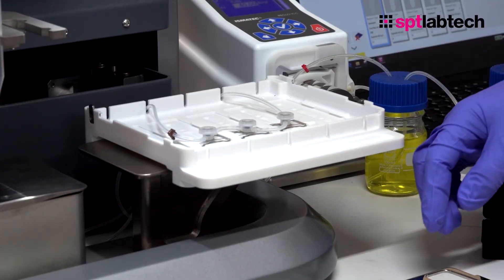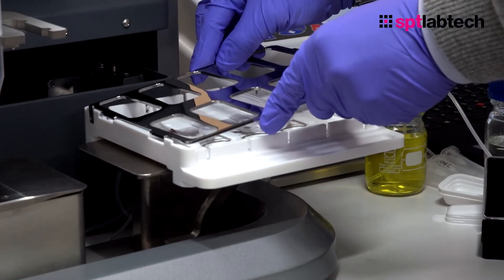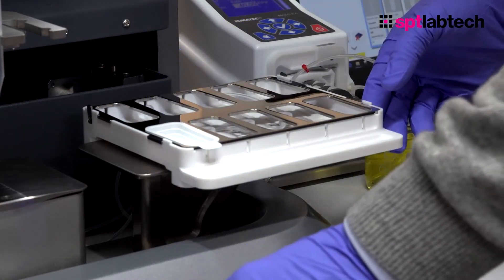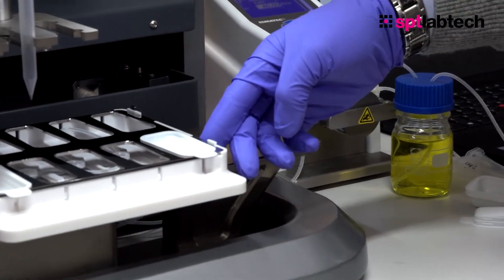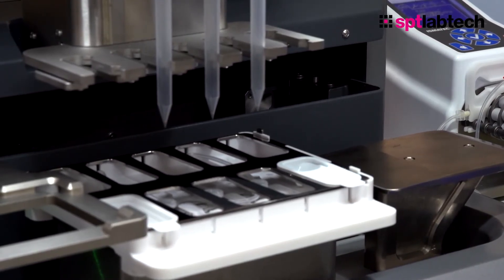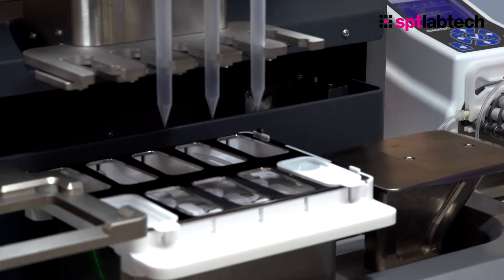Another feature of the Auto Feed Reservoirs is that they can actually be used in conjunction with the standard manually fed reservoirs by placing this holder tray on top. I can now add either a standard reservoir or a low dead volume reservoir to the tray and use them in conjunction with the Auto Feed Reservoirs. This is really useful if you have a very scarce amount of a precious reagent and you'd like to use the very low dead volume reservoir in conjunction with a bulk reagent where you would want to pump it through the Auto Feed Reservoirs.